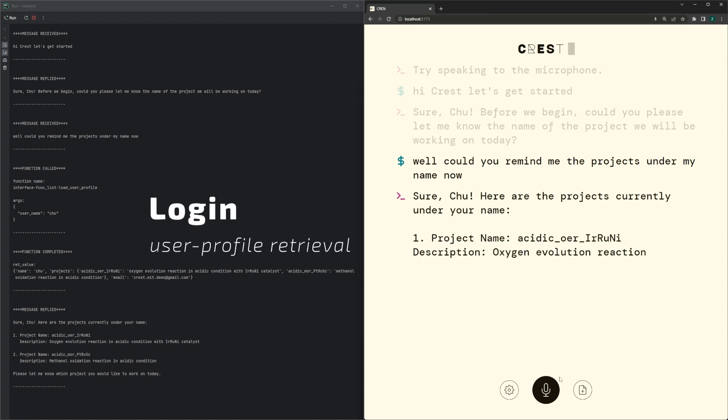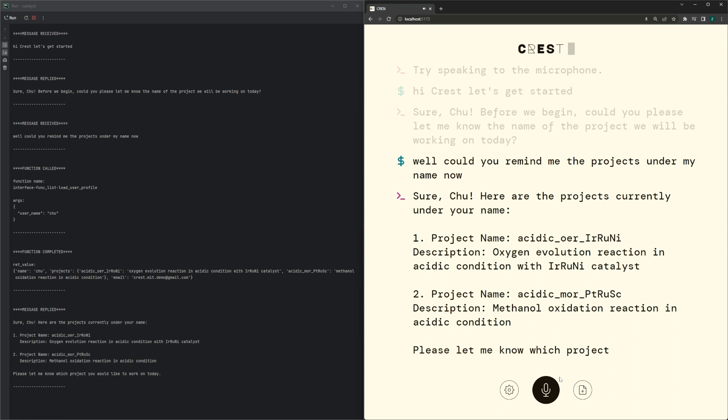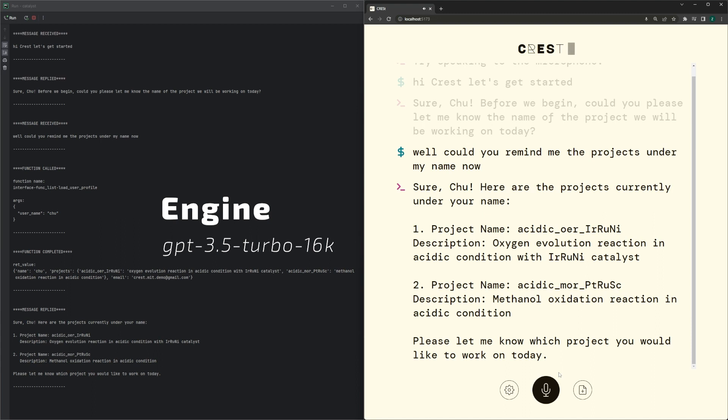Project one: AcidicoER Iridium Ruthenium Nickel - Oxygen Evolution Reaction in Acidic Condition with Iridium Ruthenium Nickel Catalyst. Project two: Acidic MOR Platinum Ruthenium Scandium - Methanol Oxidation Reaction in Acidic Condition. Please let me know which project you would like to work on today.